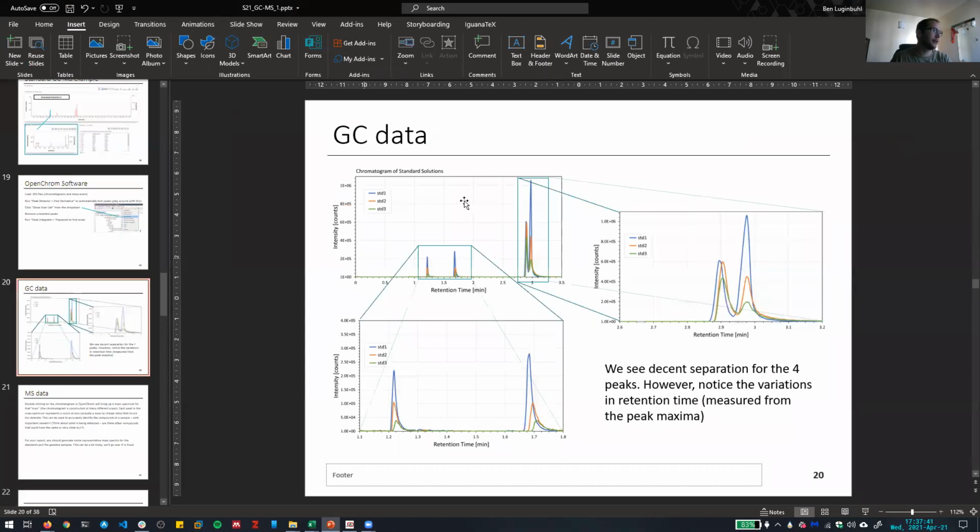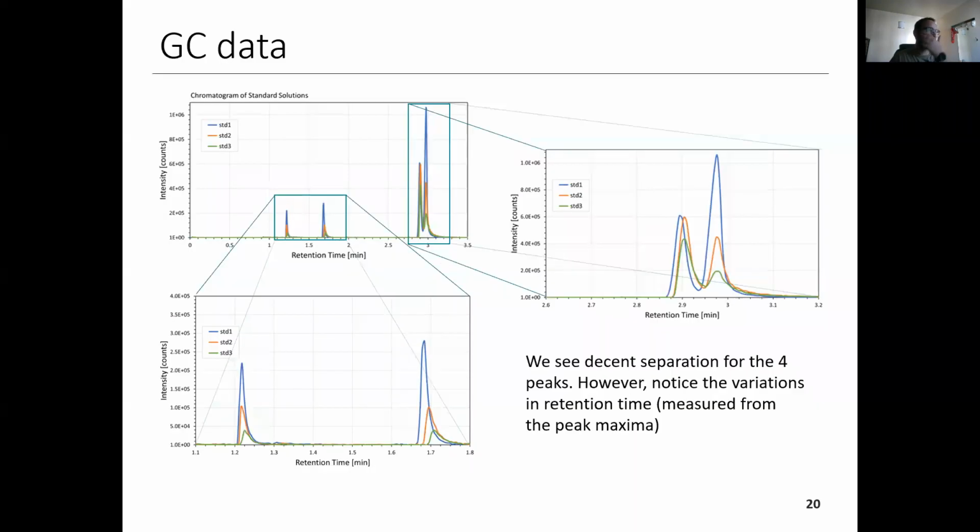and talk about, okay, so here's an example of what I was talking about, where if you export those CSV data for the different standards and stuff like that, you're able to then work with those graphs. So you can plot things like this to show that our different standards do in fact decrease the peak area for those different peaks, which is nice. We expect that from our data.